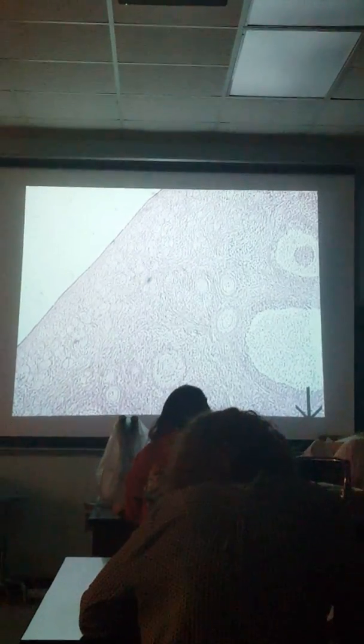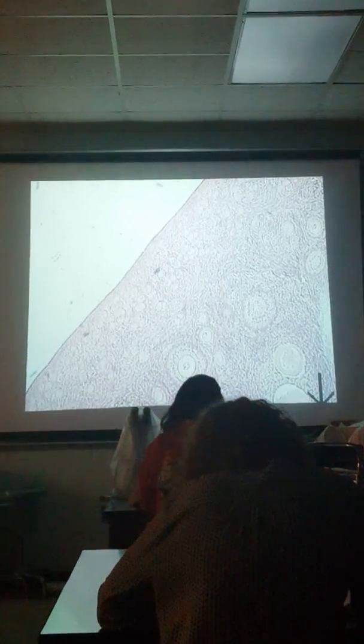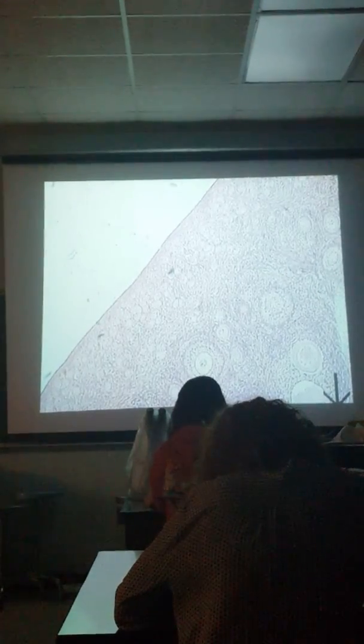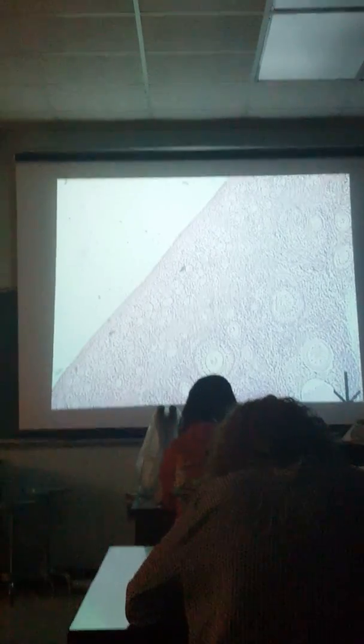Primordial follicles. You see a cluster of them up here. See, they're up near the periphery. They're all up here. These are primordial follicles and primary oocytes. Up here. There we go.